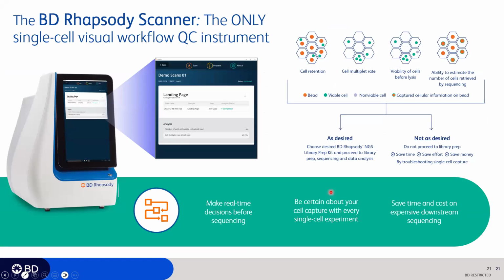So now I want to talk about our scanner and what we use it for. This instrument is really great. I really like it for my new users, and for anyone that maybe is a little bit nervous about running a single cell assay, because this is our quality control instrument. It has a cell counting function that we can use to determine the viability of our samples. It will calculate for us how to make a pool of our samples and give us a predicted multiplet rate. And this is really nice in and of itself, as it gives you a really nice go, no-go decision-making option for whether you're going to run your samples that day.